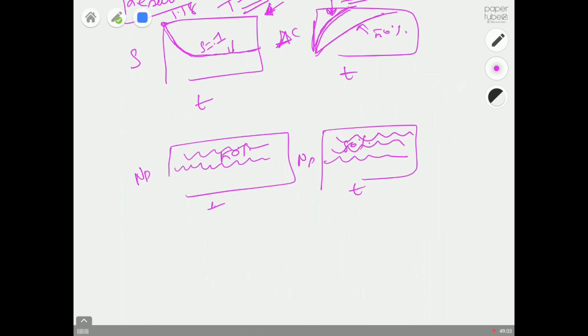I explained a few reasons in the lab video part 2, I think part 3, where I was analyzing the data, and in part 1, in this lecture and also in the previous lecture, I talked a bit about why the number of particles remains constant. It means it's a controlled crystal growth experiment. At the end of the day, our motive is to control the crystal growth experiment. I started with some number of particles, and then I finished with exactly the same number of particles. That's the whole purpose of doing this experiment.